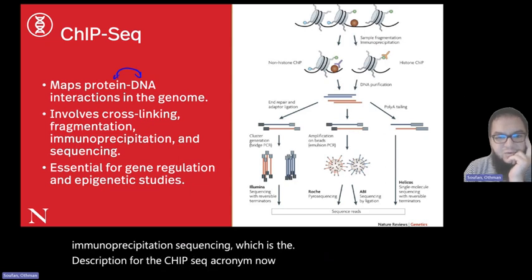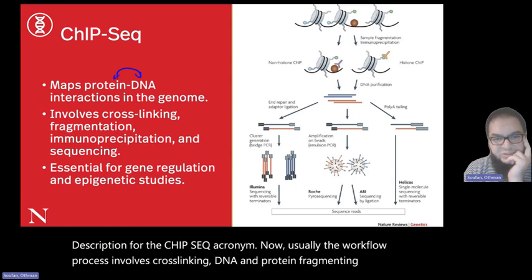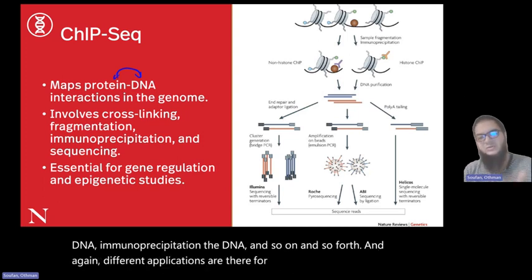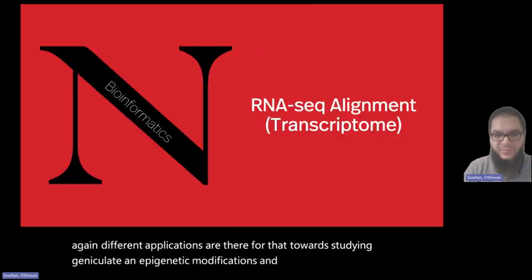Now, usually the workflow involves cross-linking DNA and protein, fragmenting the DNA, immunoprecipitating the DNA, and so on and so forth. And again, there are different applications for studying gene regulation, epigenetic modifications, and so on and so forth.